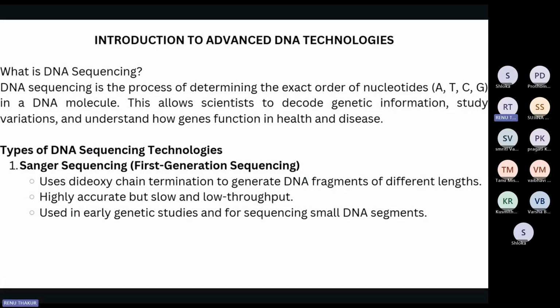So we'll start with an introduction to some advanced DNA technologies. DNA sequencing technology has evolved a lot over these years. First, let's look at what exactly DNA sequencing means. So DNA sequencing is the process.